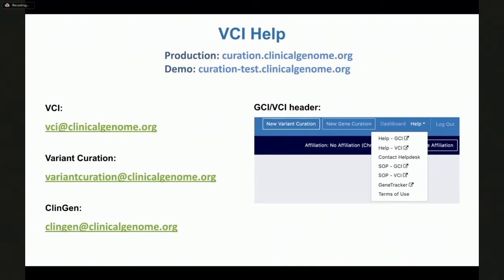So I think the one maybe we should start with, which I'm very excited about, is we're actually planning on launching very soon the audit trail, because we currently do maintain in the back end of the software essentially an audit trail. So if we ever needed to figure out who had done what evaluation at what time, we could go back into our data system and identify all of that. That's been true from the beginning.